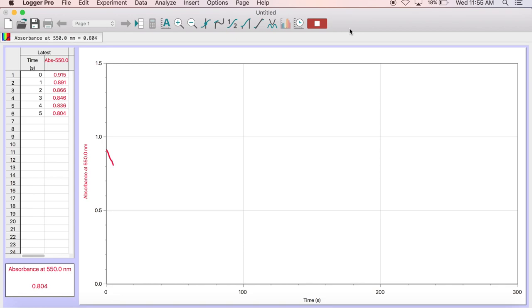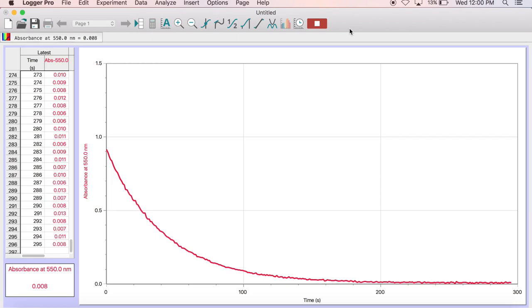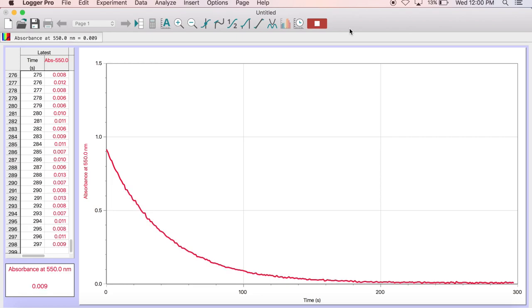When the time is up, the data collection will automatically stop. The absorbance values of your reaction mixture should be less than 1. If it is greater than 1, please dilute your drug solution more and try the reaction again.